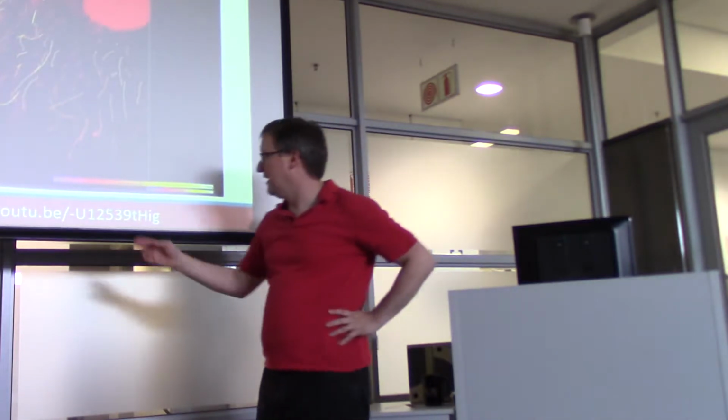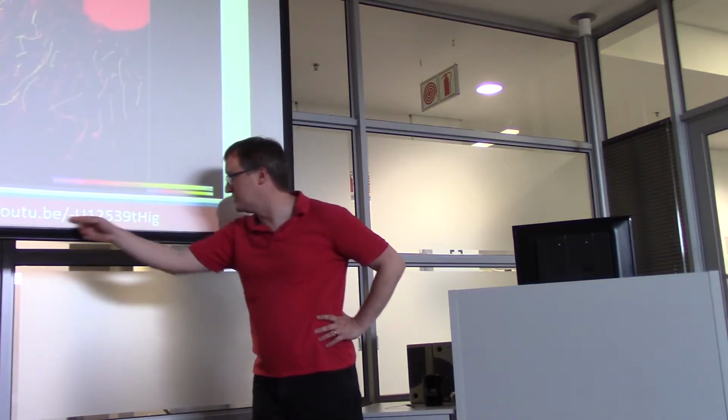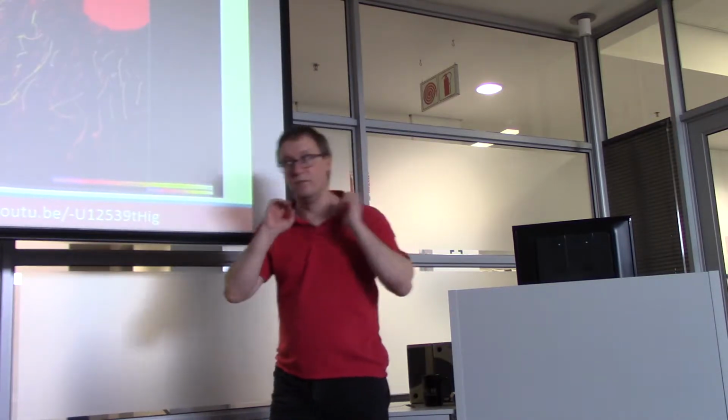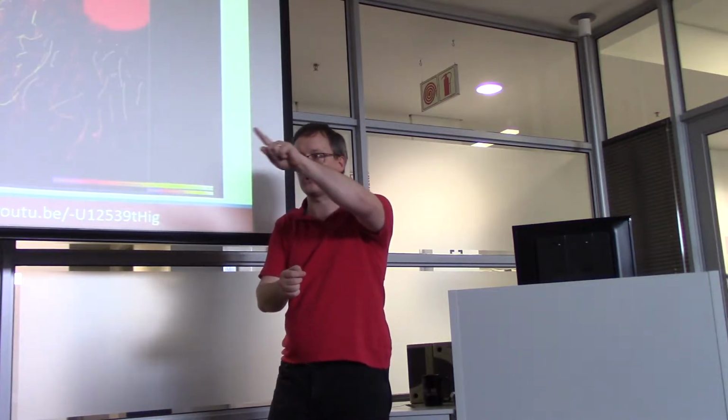Now, I am very fond of videos, but I have to say I don't include them in slides very often. So if you look at this YouTube link on your own computer, you'll be able to see an example of this motion analysis. Here we're looking at cells emerging from the embryonic quail heart. You see all of these little traces? That is a computer reconstruction. This is not the image data themselves, but rather the software being able to track how individual cells are moving from frame to frame over an interval of time.